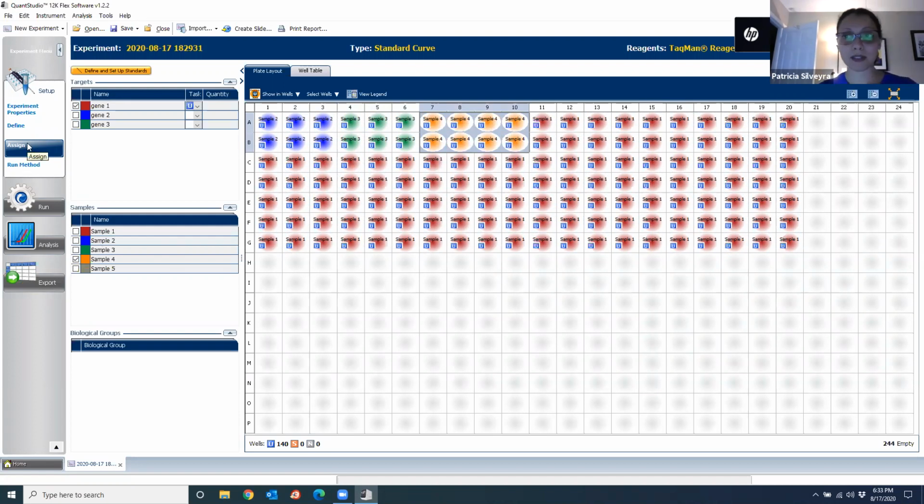Okay, so once you have your plate with the probe and the sample that goes on each well, you have to add the controls. For each of the genes that you're measuring, for example, I'm going to do it here in a tiny place. If here is gene 1, these 3 are sample 1, and this one is your non-template control. Rather than selecting sample 1 here, what you do is you click on N. That means the non-template control. So you'll see here that it says N.